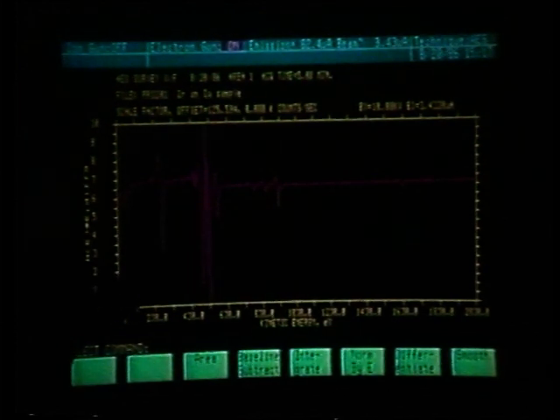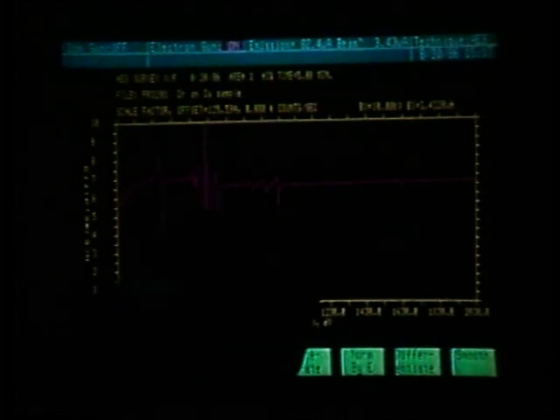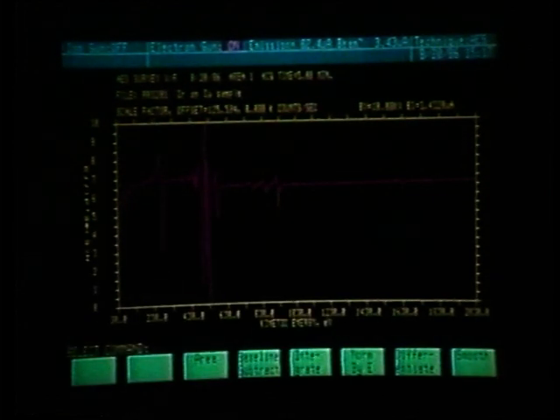Most likely, carbon is only on the surface and will decrease, but we want to be sensitive to the carbon because it's possible that there is a carbon contamination between the chromium and copper layer. So let's go 10 sweeps on the carbon, and the chromium being very weak, we will go 20 sweeps.